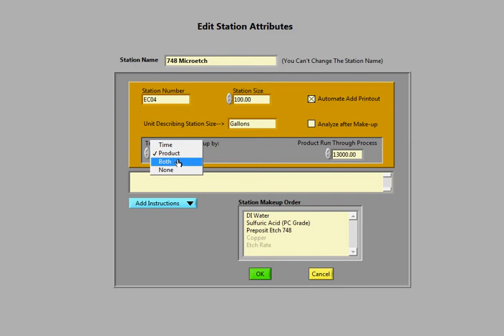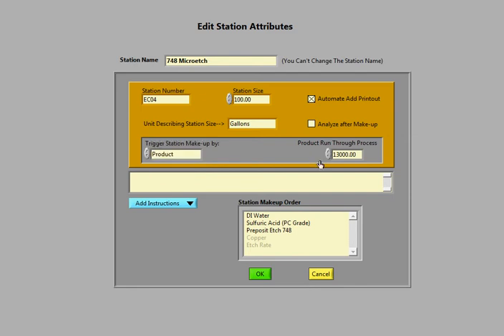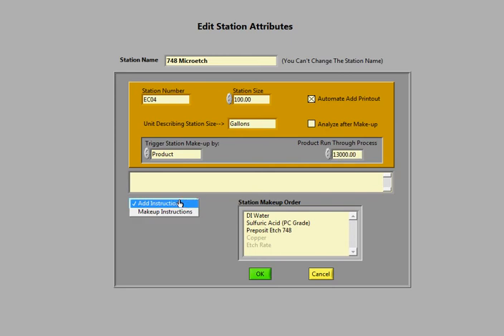You can schedule a makeup bath based on time, product, or both or none. And here you enter in how much product runs through the process before you do a makeup. There's also different add instructions and makeup instruction options here. And we can go through those later.